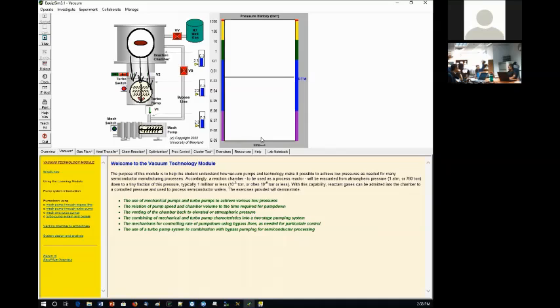So this partial pressure balance will be lost: 20 torr from the water vapor, 20 torr from another vapor, and the other part is oxygen. You're going to abruptly take all the oxygen from this line while still keeping some of the water vapor here.